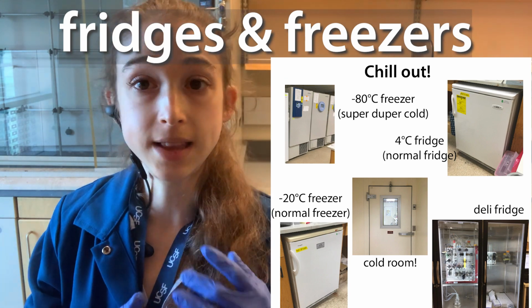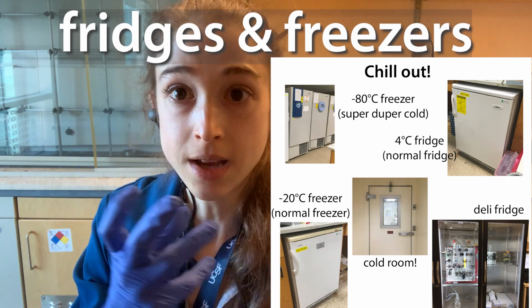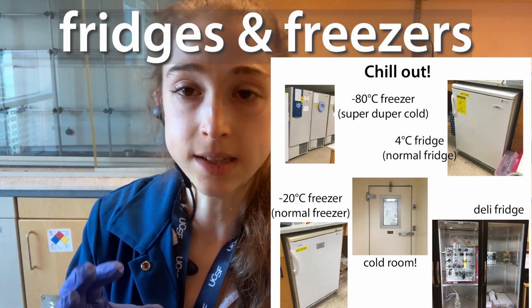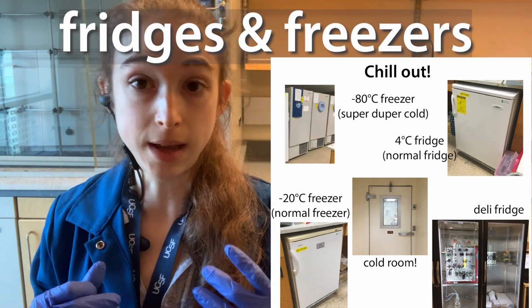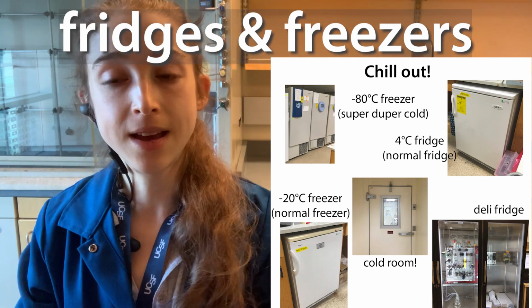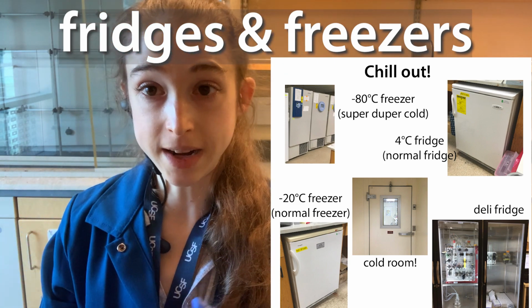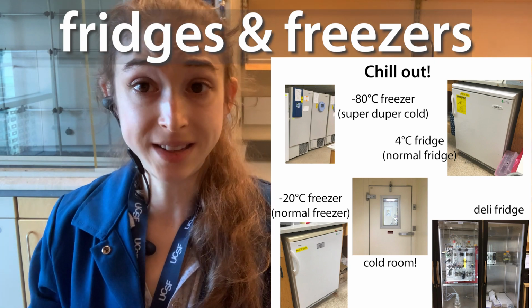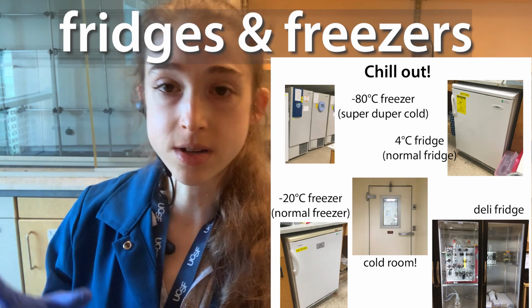So remember minus 80, that was about the temperature of the carbon dioxide, the CO2, solid CO2, aka dry ice. And so this is a common temperature at which we store things like proteins. These minus 80 freezers are typically really big. Our other freezers and refrigerators you'll find in a variety of sizes, and these are just typical, like the same ones you would have in your house. So we have the small ones like under the bench, we have the bigger ones.